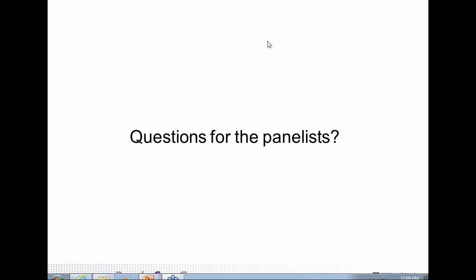Okay, so someone has asked, what are the ABHI guidelines for purity of subpopulations at this point based on clinical relevance? Is there any experience or success with repurification in the instance where purity is low, so below 50 to 80%? There have been a few questions about purity. Where do we see any low purity? What's done about it? But perhaps, Wendy, you might answer the question about the ABHI guidelines for purity, if there are any that you're aware of.